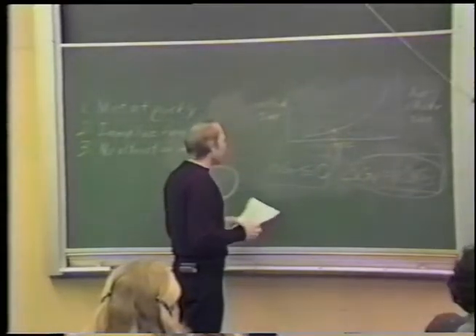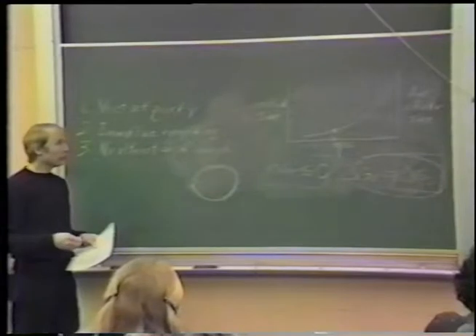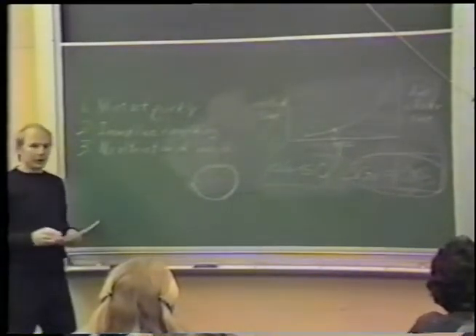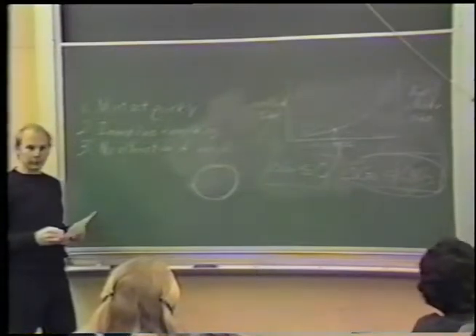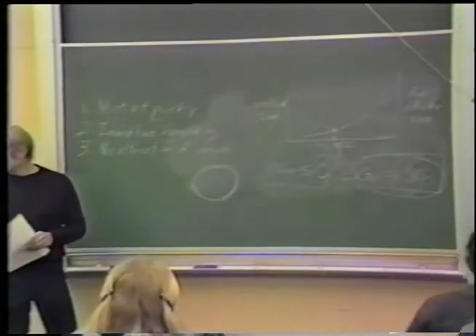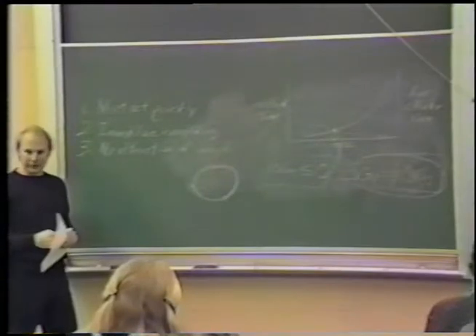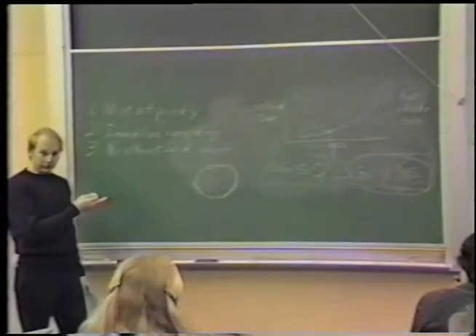Okay. And the condition in which you have ultra-rapidly frozen the sample, in which you've gotten ice crystals which are so small that any damage they've caused is not visible at the electron microscopic level of analysis, is commonly called specimen vitrification. You'll see an awful lot of claims in the literature that the specimen has been vitrified. And what is actually going on is that they've gotten ice crystals so small they couldn't see them.